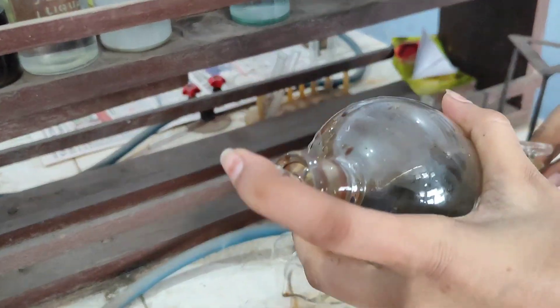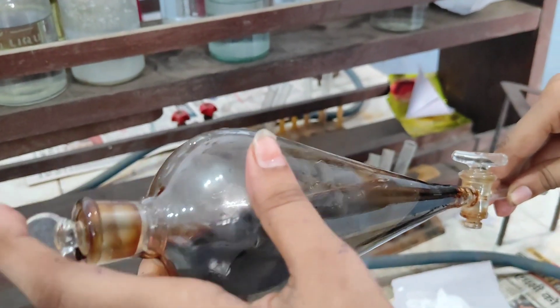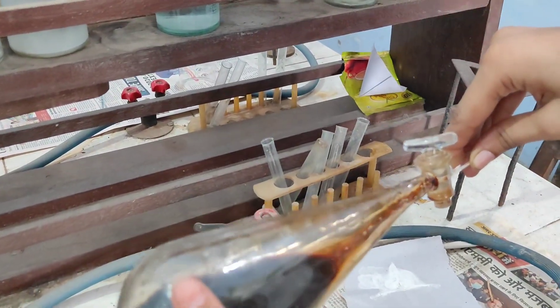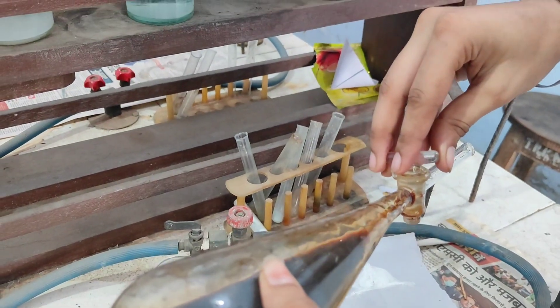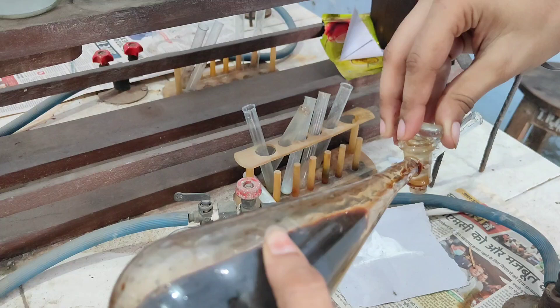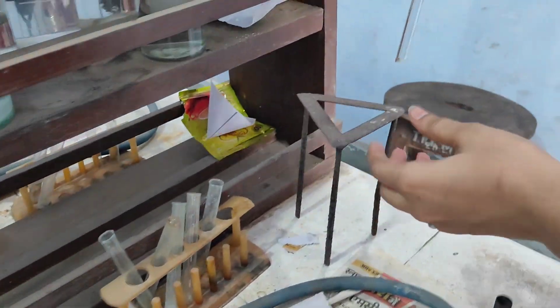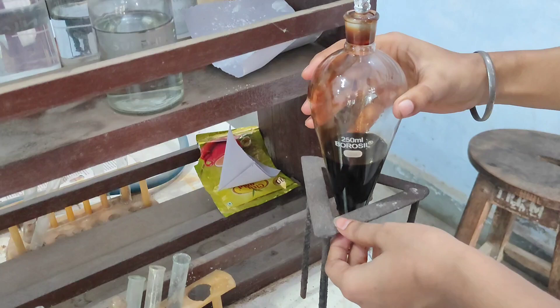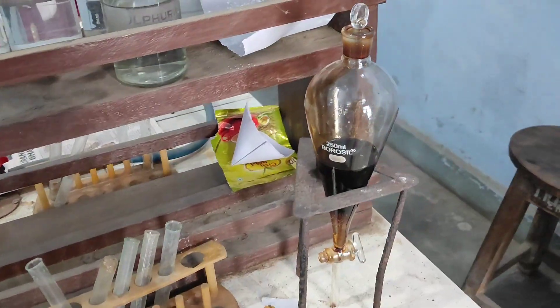After mixing two to three times, we remove the air by opening the nozzle. Once the air is released, we place the separating funnel on a stand and let it sit for about 10 to 20 minutes.